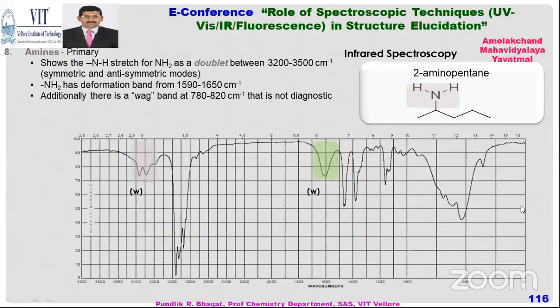Similarly, NH2 group, this is the beauty. Primary amine, secondary amine, and tertiary amine can be identified by using this. You will find 2 humps here, NH2. These 2 humps indicate that 2 hydrogen atoms give 2 peaks, while one hydrogen atom gives one peak. It is around 3500 or 3400, which sometimes may merge with the moisture peak. That is why our sample should be moisture free.